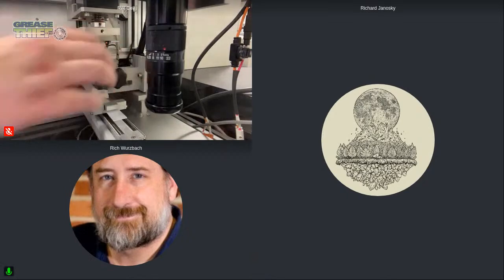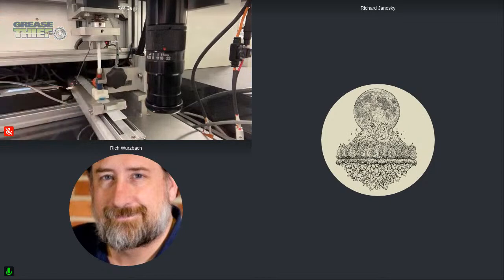Yeah, and there are some limitations here, right? We sometimes find that greases that have significantly hardened, or greases that have a lot of contaminant or wear particles in them, will be unable to undergo a full extrusion, right? Yes, that's correct. Especially grease samples that have larger particles. It depends on where they're at in the grease thief, because as we know, wear and contamination is not 100% homogeneously spread throughout our grease body. If it's right at the beginning, the die extrusion would be clogged pretty quickly, and you might not get a full run. Whereas if the particles are at the end, you might get a full profile extrusion and then the particle effect at the end. But yes, large particles can cause a buildup of pressure, and then it stops the machine to protect the load cell.